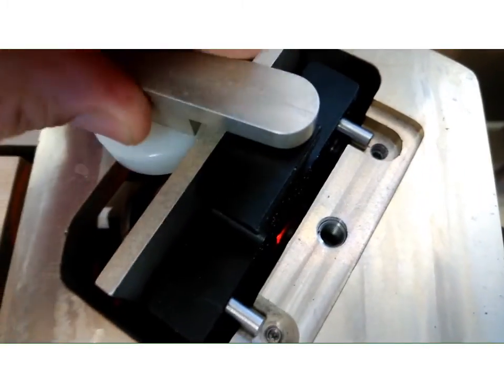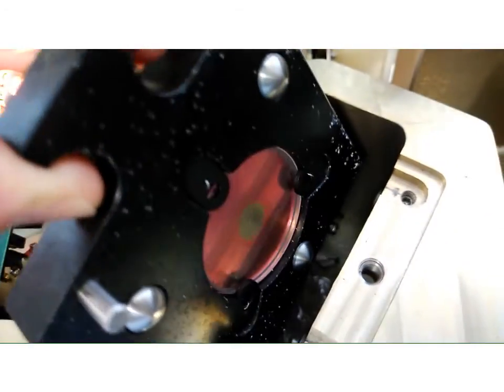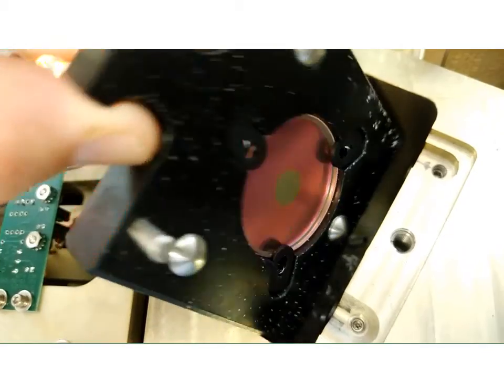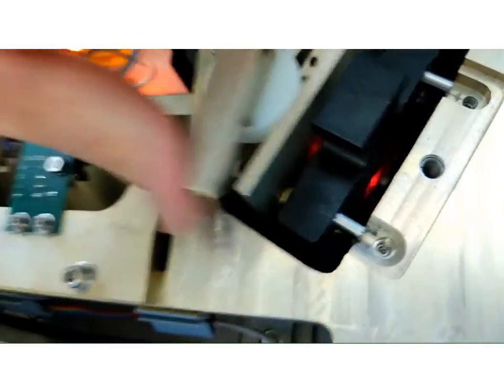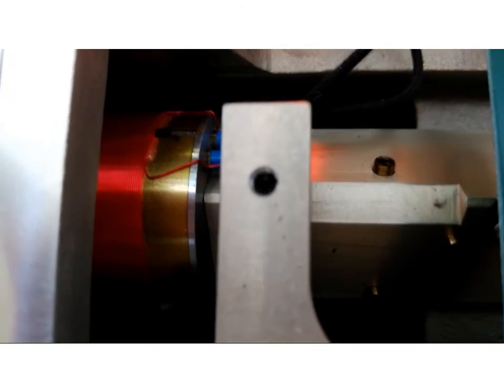Here is the beam splitter. A beam splitter splits the light from the light source into two. This part is the electromagnet for moving the moving mirror. You can see that the moving mirror is attached to the tip part and it moves finely. The position of the moving mirror is determined by adjusting the current flowing through the coil. The fixed mirror is behind this, but you can't see it.